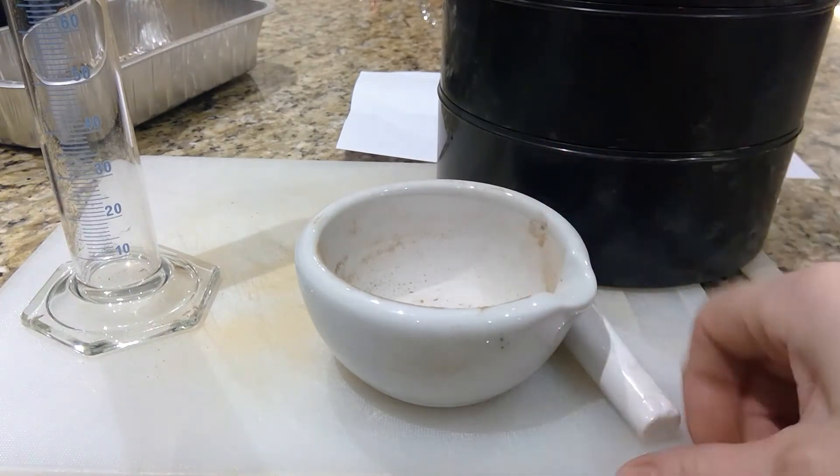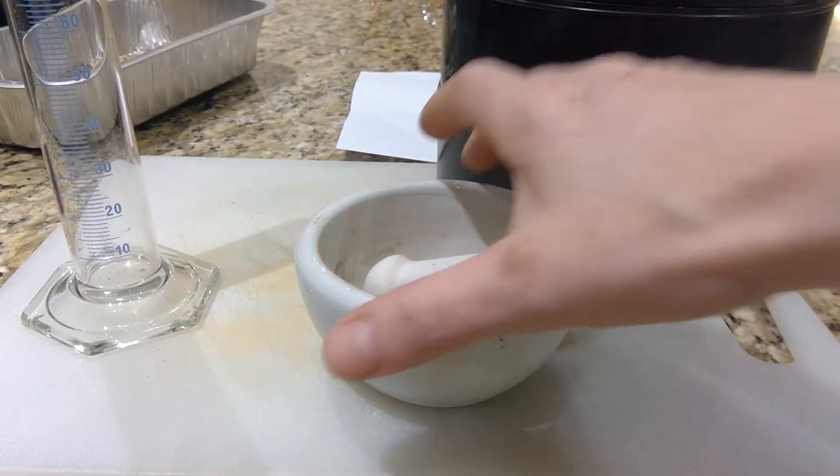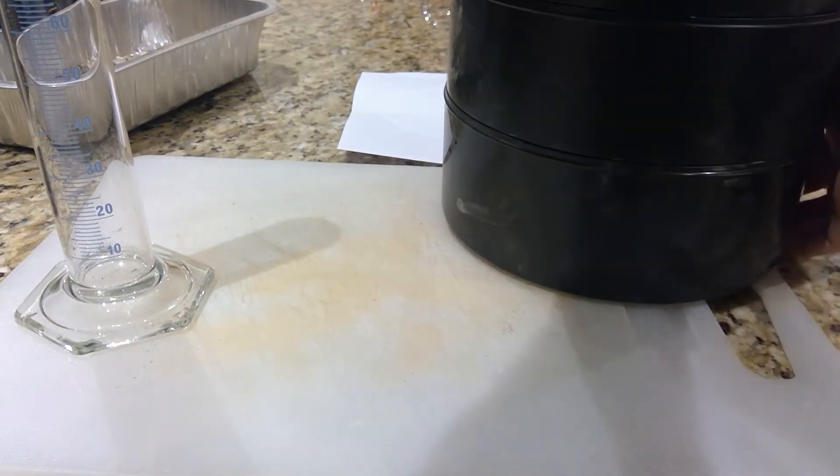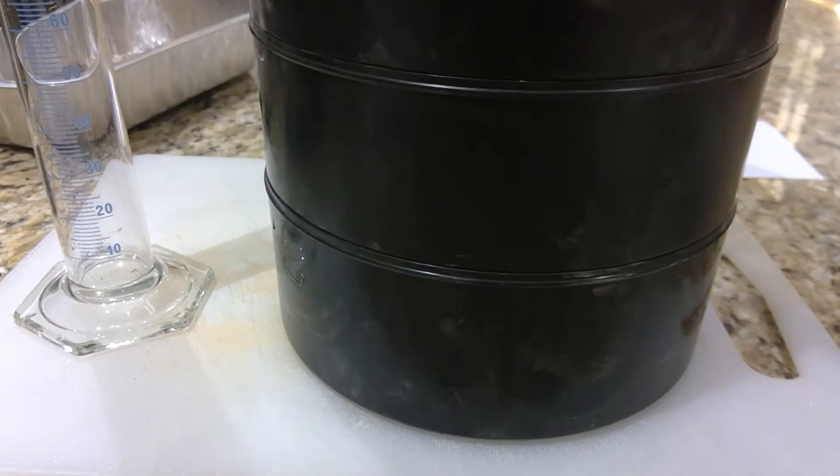I ground it down in the pestle and mortar and then put it into the largest tray in the soil sieve. What I'm trying to do here is remove any particles that are greater than 2 millimetres, so it will just give me sand, silt, and clay.